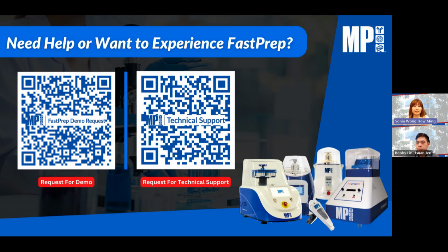That is contributed by the different sizes of the beads or material. So with a better choice, a matrix that has a good balance of both worlds, the next step is for you to optimize the speed and the time of homogenization in order to achieve your specific objective, which is the cortisol level that you would want to get. Okay, thank you, Dr. Sonia, and thank you for the question.